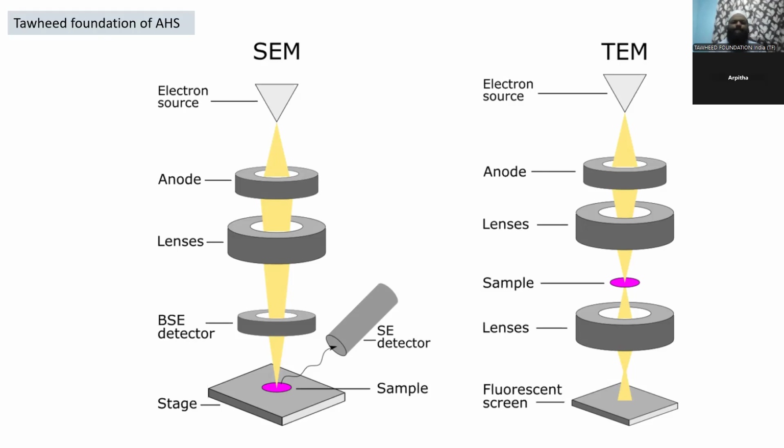In a scanning electron microscope, the image is focused by a scanning electron beam onto the surface of the specimen in a raster pattern. Applications: electron microscopes are used to investigate ultrastructure of a wide range of biological and inorganic specimens like microscopic cells, large molecules, biopsy samples, metals, crystals, which are usually not possible in bright field or any other different types of optical microscopes.